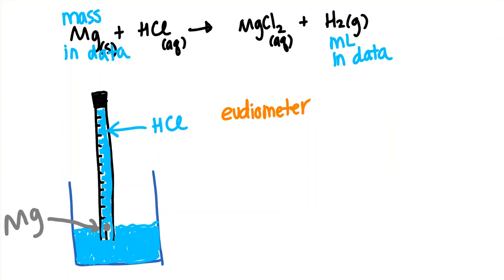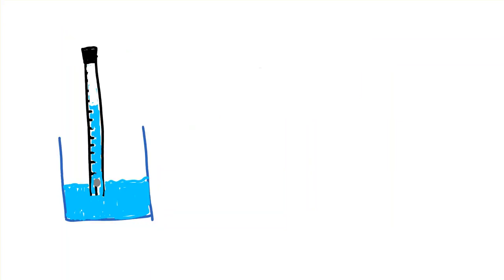So anyway, once you invert this, the hydrochloric acid that's in there reacts with this piece of magnesium that's down here, and then the bubbles that are formed will go up in the tube. As it reacts, the gas bubbles up through here, and it pushes out the extra liquid. So the gas that is up here is our product, hydrogen, but it is actually going to also include water.